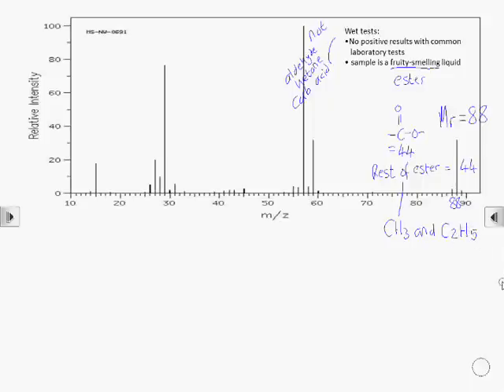Now we need to match the possible fragments of the molecule to the peaks in the mass spectrum. A CH3 would show up at 15, so CH3+ fragment. An ethyl fragment would show up at 29, so that's C2H5+.